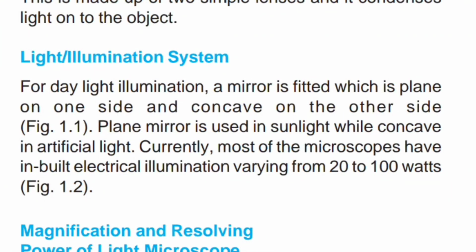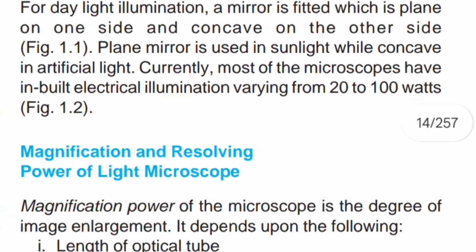Currently most of the microscope have inbuilt electrical illumination varying from 20 to 100 watt. Magnification and resolving power of light microscope. Magnification power of microscope is the degree of image enlargement.